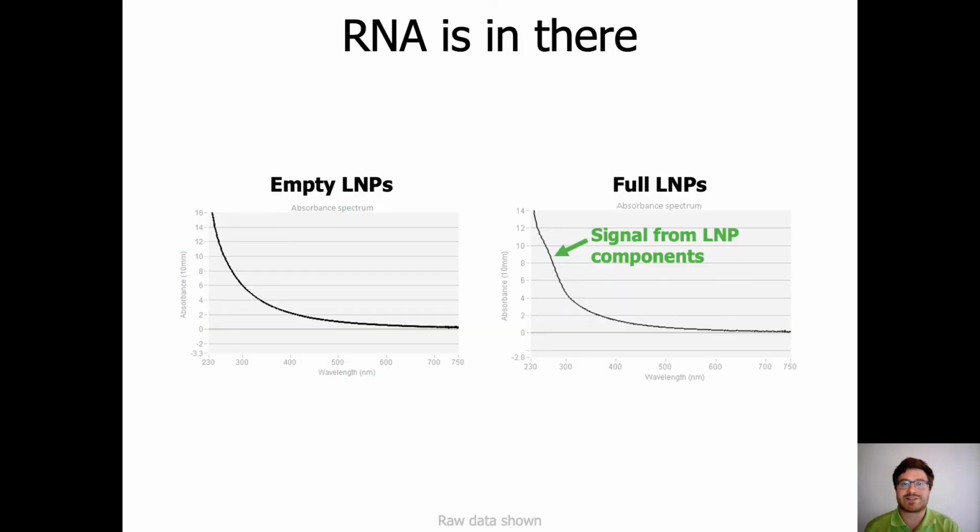Now let's take a look at some RNA LNP samples. The empty LNPs create a whole lot of signal that looks like absorbance, but it's actually turbidity, and usually isn't helpful and just gets in the way. Because all that turbidity makes quantifying with traditional UV-Vis almost impossible, and total RNA quant by UV-Vis is normally a big challenge. For example, if we squint at the full curve, we can see the RNA bump at about 260 nanometer, but the difference is pretty small.